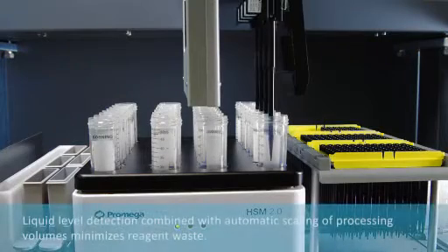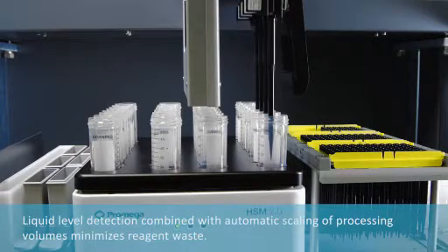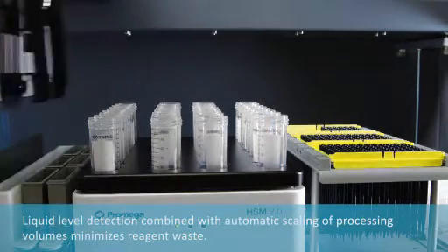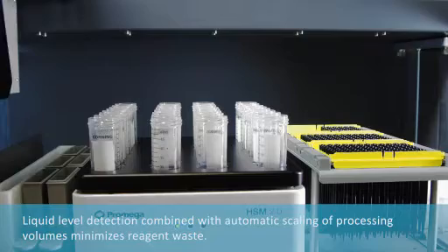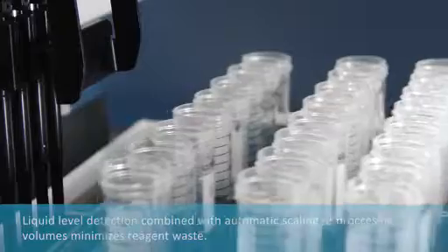The instrument uses capacitance liquid level detection to measure the volume in processing tubes and calculates the optimum amount of reagent for each sample. This ensures optimal processing and minimizes reagent waste. Small-volume reagents are added with disposable tips.